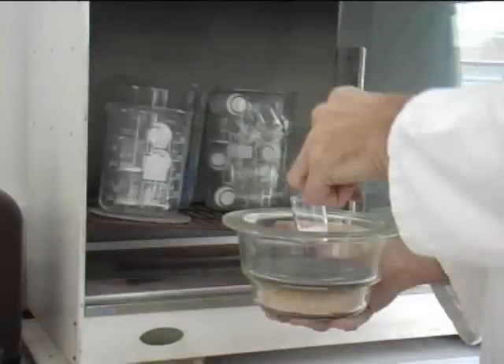A Buchner funnel and filter could be used to filter the nickel complex, but it would be almost impossible to dry to constant weight, so a glass sinter is used. Never handle the sinter with hands — use tongs, as grease from the fingers will add weight to the sinter.